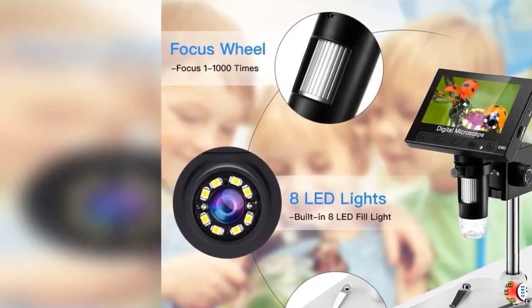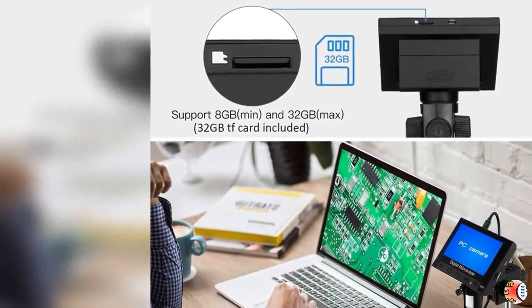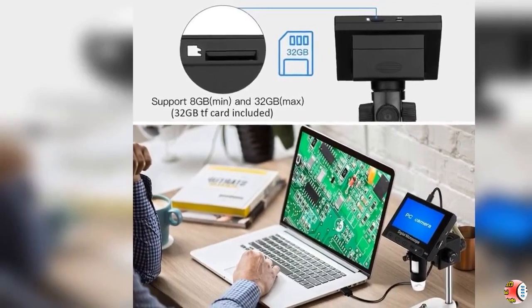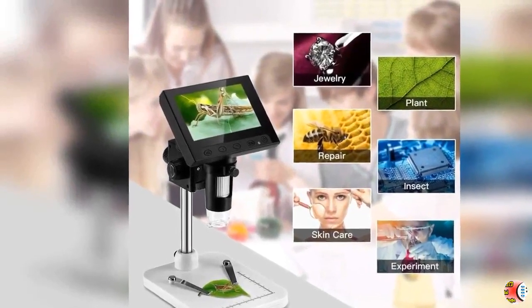Feature 2 — 4.3-Inch LCD Display: This digital microscope comes with a 4.3-inch screen and 500x-1000x magnification, along with 8 adjustable LED lights, which provides a bright field of view and is suitable for use in various environments.